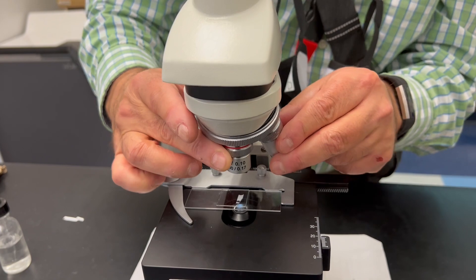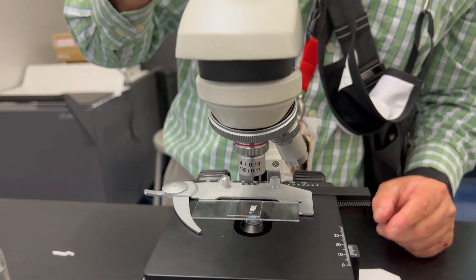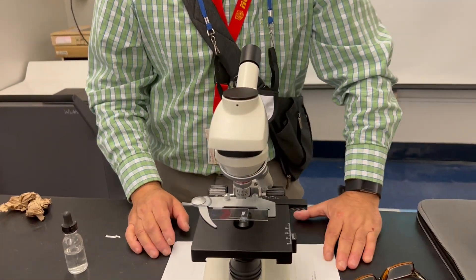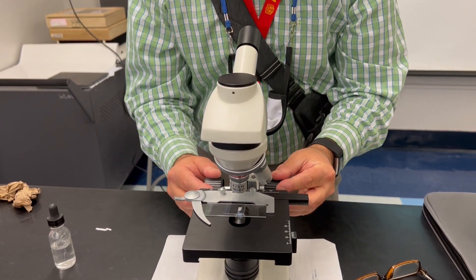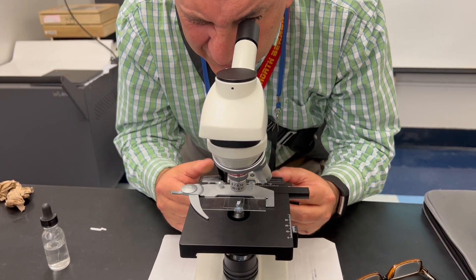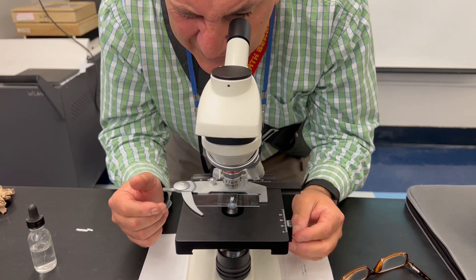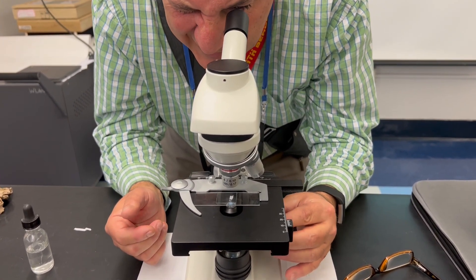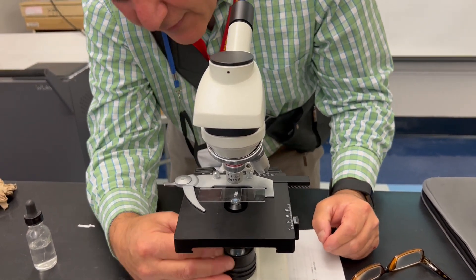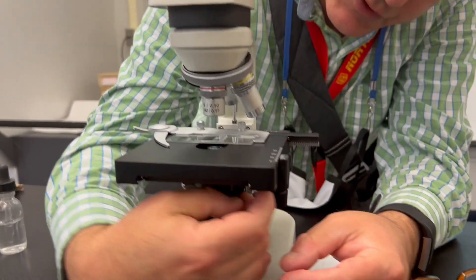I have it on my lowest objective — this is the scanning lens, four times. Four times ten is forty times total magnification. Now I'm going to put my eye to the eyepiece and put my hands on the coarse adjustment, then continue getting closer and closer until I see the E. I can see it, but it's not centered, so I just have to re-center it. I want that E right in the center. I can also adjust the light using my iris diaphragm if it's too bright or too dark.